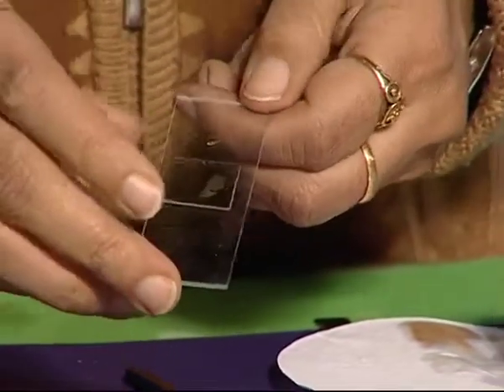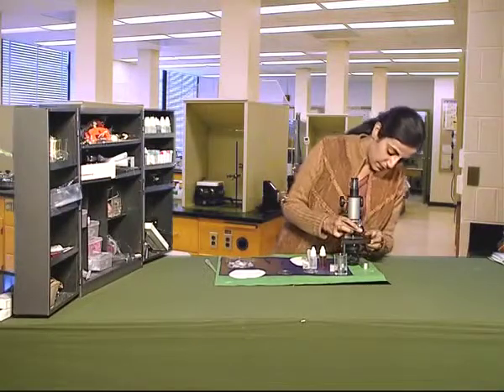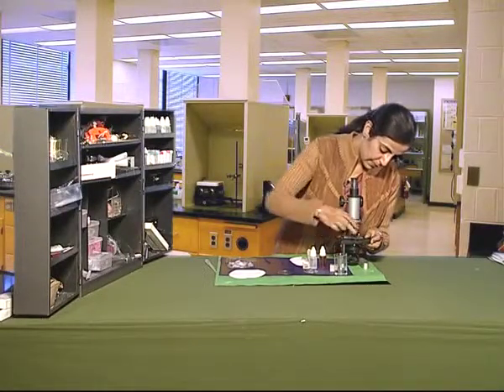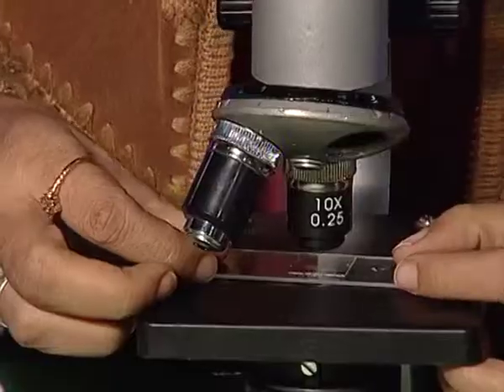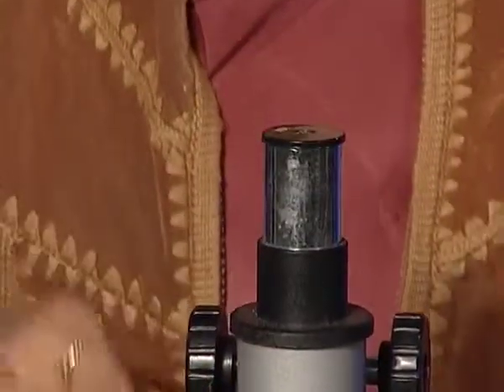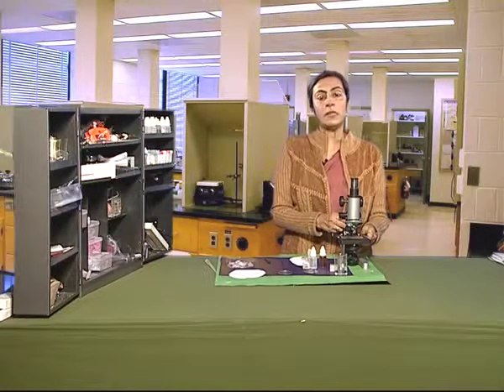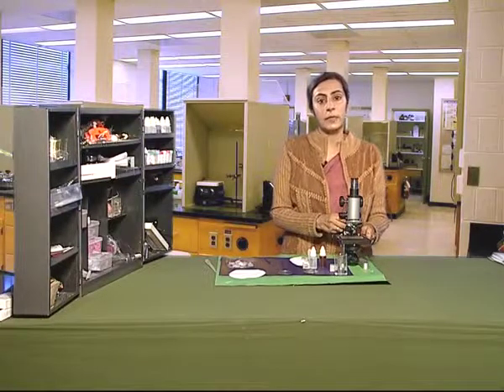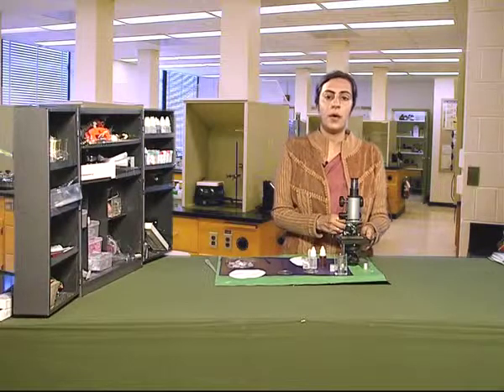Observe this under the microscope. What do you observe? We observe small cells like bricks with a nucleus in them. And this is how plant cells look.